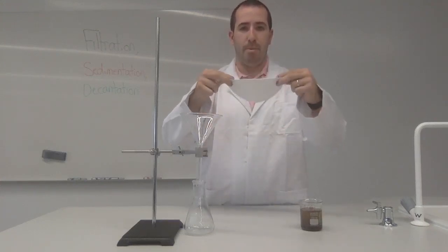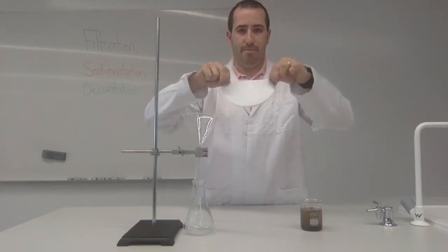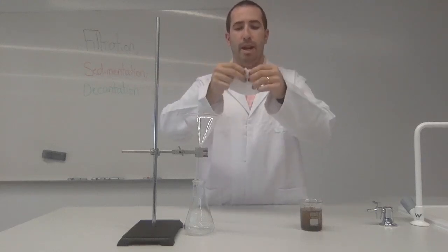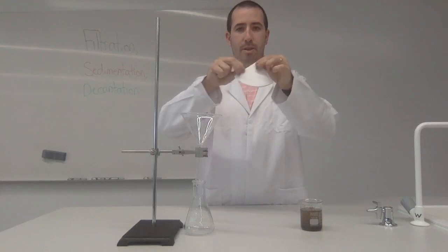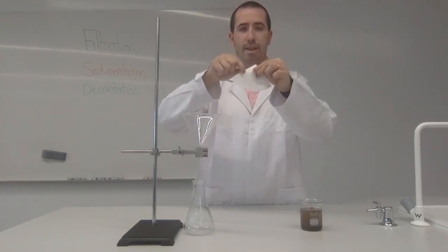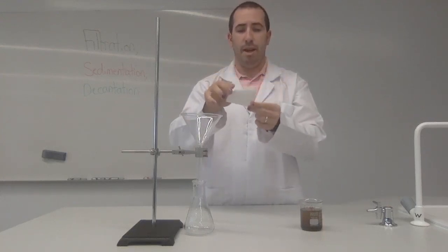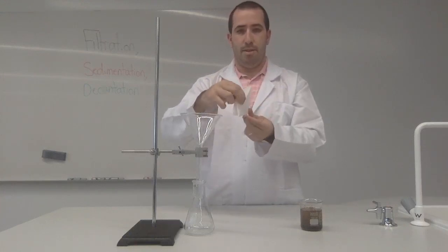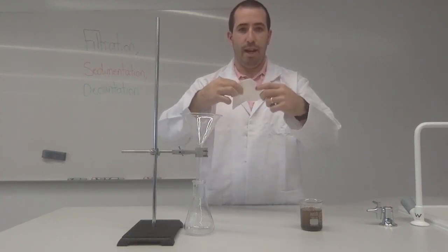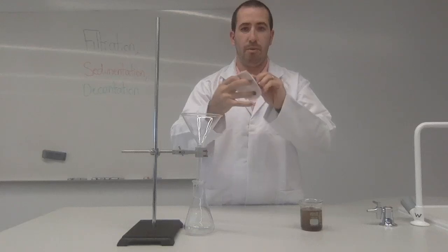We fold the paper in half. We fold it in half again. So it's a nice little quarter, nice little arc we've got going. Then we'll just open it up. Use the other side and it goes like this. So a nice little cone we've got.